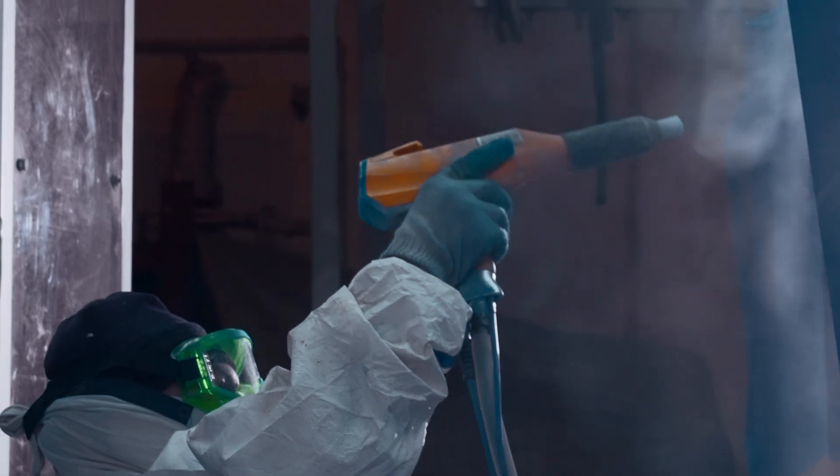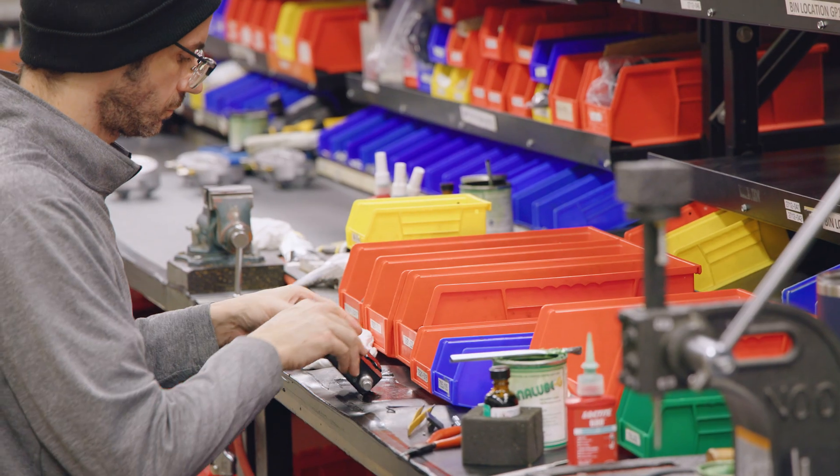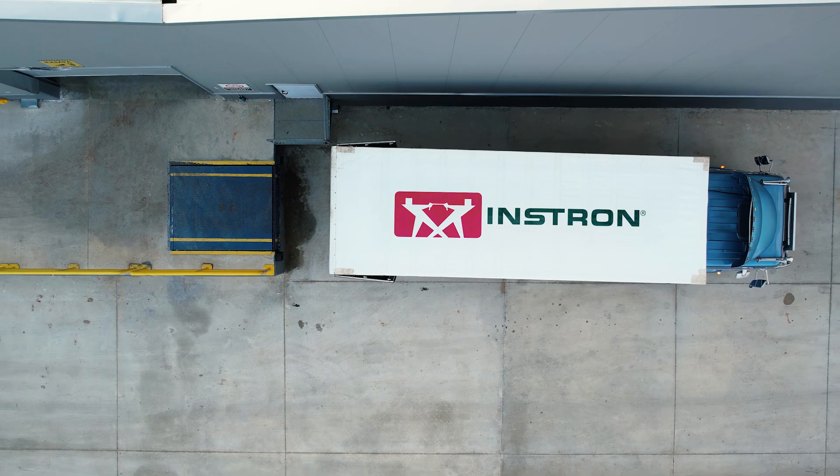After machining, parts are plated, painted, and heat treated locally before the team assembles, tests, and kits for stock, ensuring tight control over quality and rapid delivery to Instron customers worldwide.